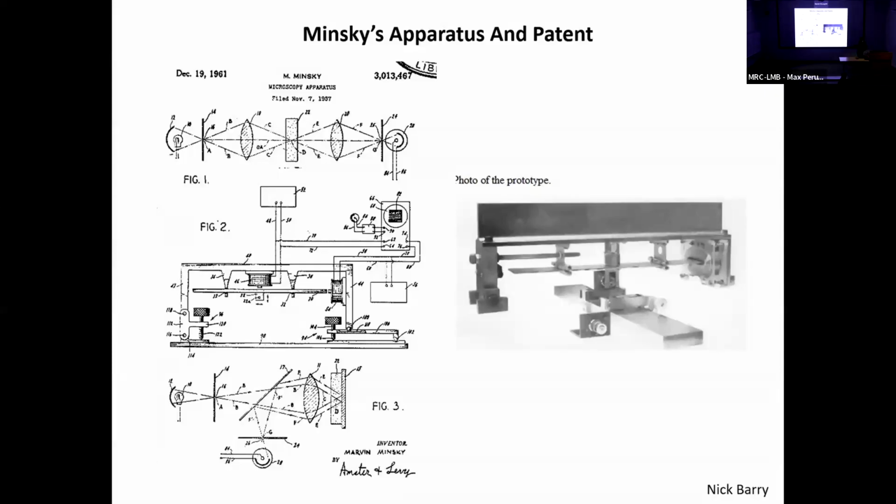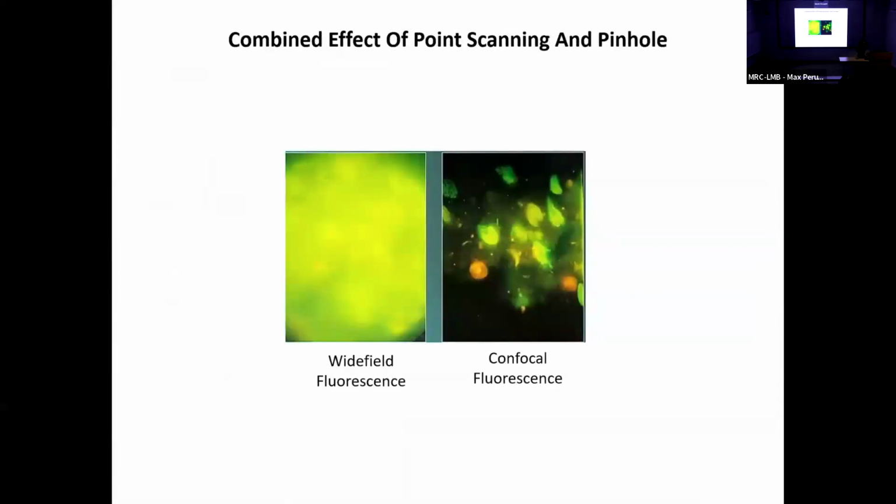It didn't solve the problem of how the human brain works, but it's been an extremely useful tool in cell biology and biological microscopy in general. So this is a problem it's solving. Here, you got some object which is obscured by all of this out of focus fluorescence. You stick the pinhole into the system, scan, and suddenly you can see all the detail.